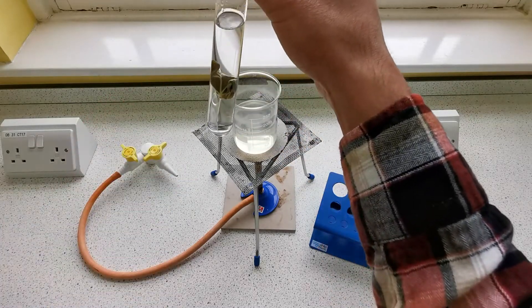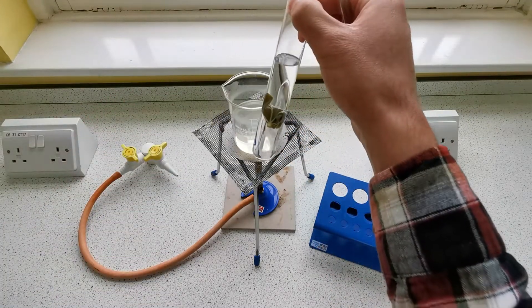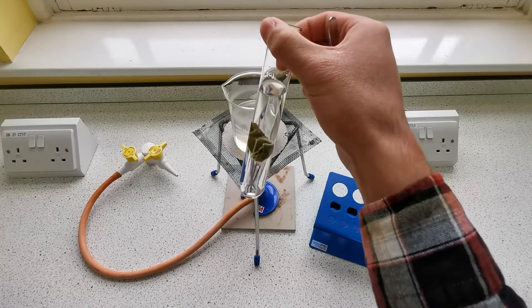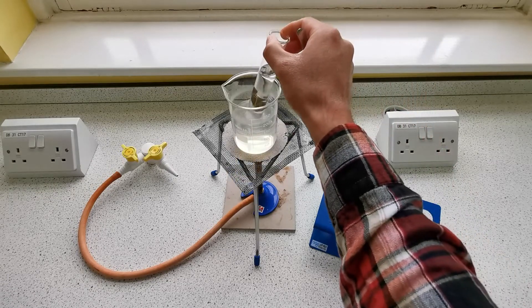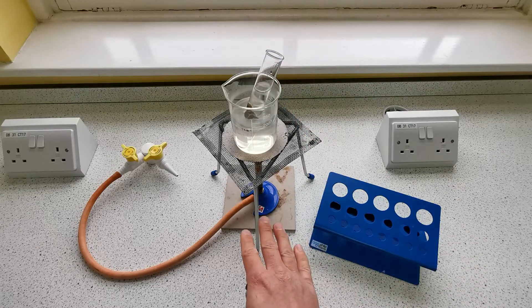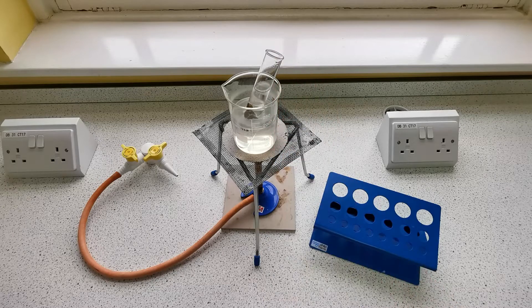We want the chlorophyll to dissolve out of the leaf so we can see the colour change better, and we want this to happen at a faster rate. So we're going to put the boiling tube of ethanol into the hot water — the Bunsen burner isn't on, we're just using the residual hot water — and leave it there for about 15 minutes.